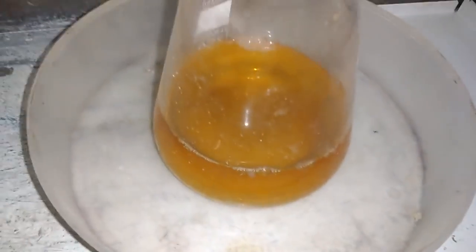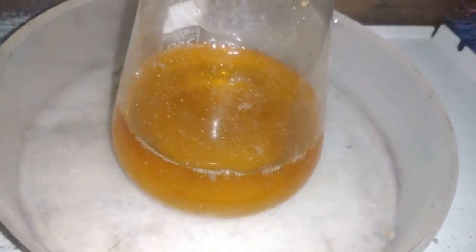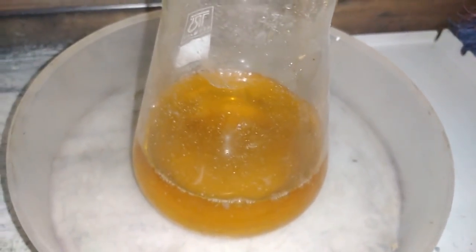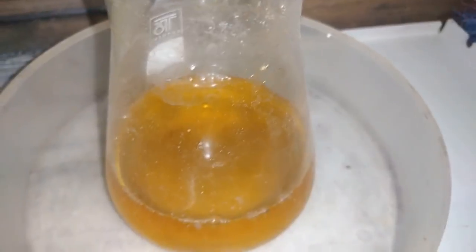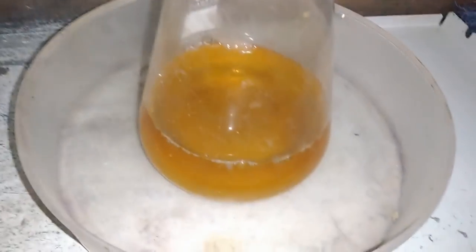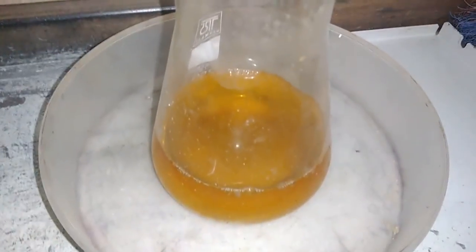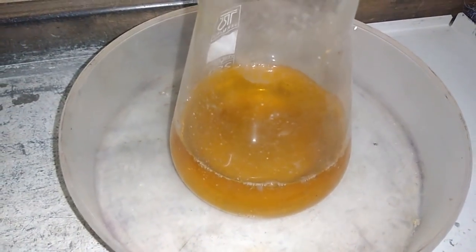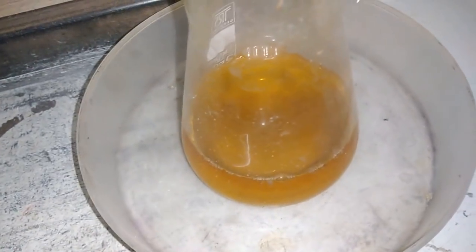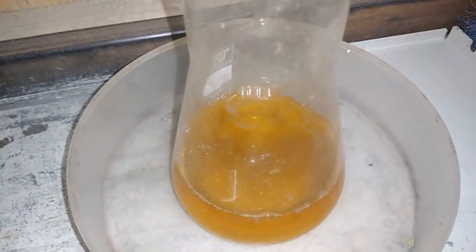Look at that — this is our palladium solution, it's pretty clean and a nice color. Not too much palladium in there, but a very little amount of palladium can color the solution to look like much much more. So right now my next step is to drop that palladium and dry that powder to see how much I actually get.